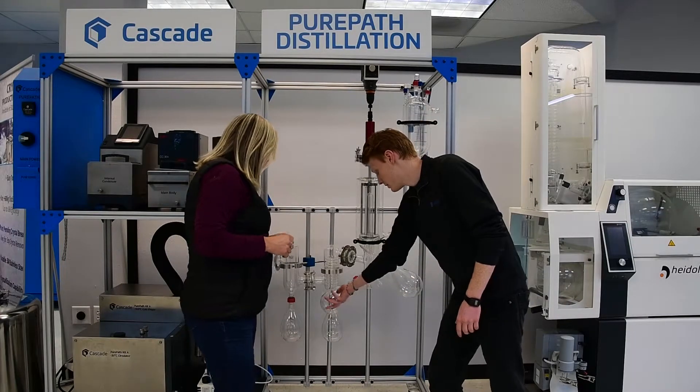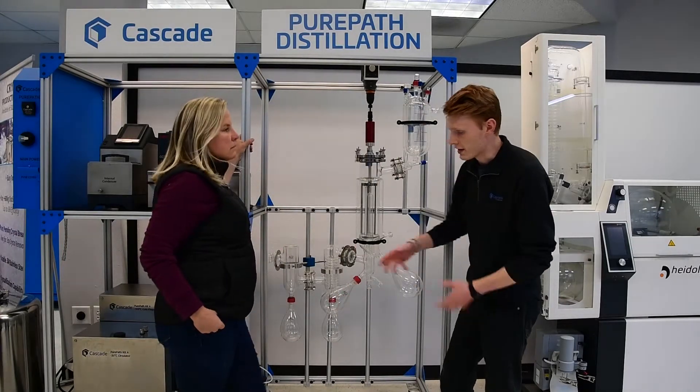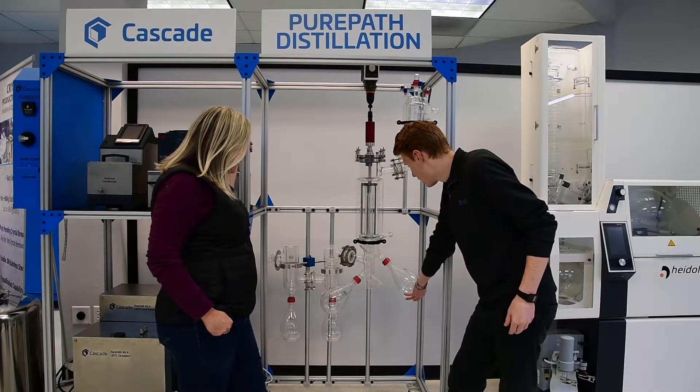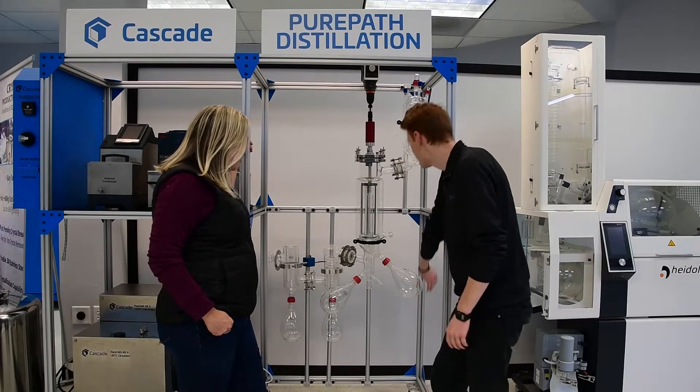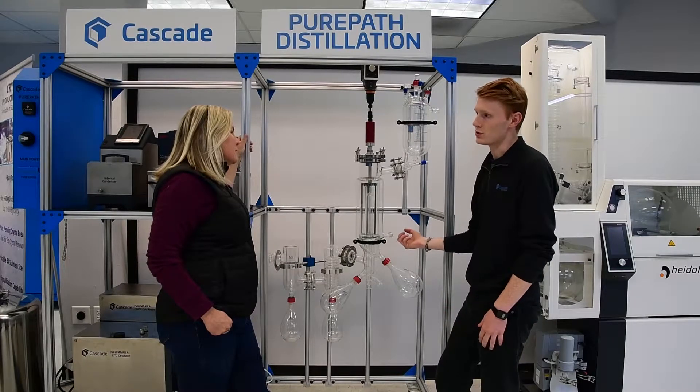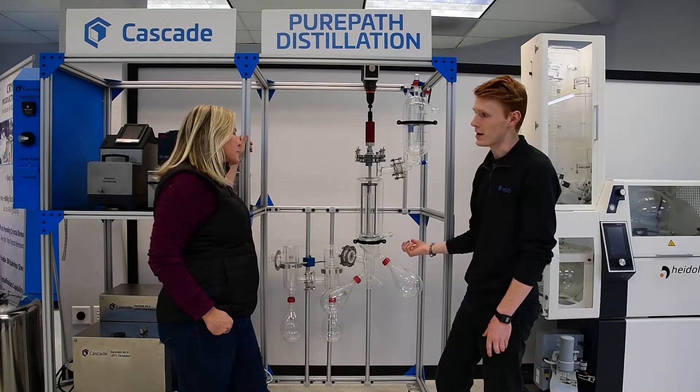You would then take this flask off, dump it out, save the terpenes to use for later, and put your heavies back in through the top and distill them down again at a higher temperature so you can get other constituents out of it.